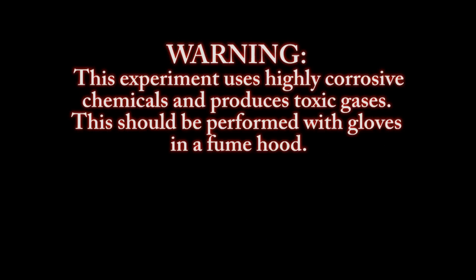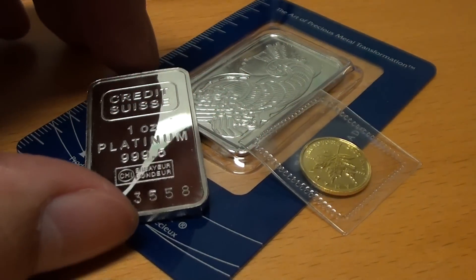Warning, this experiment uses highly corrosive chemicals and produces toxic gases. This should be performed with gloves in a fume hood. Greetings fellow nerds.